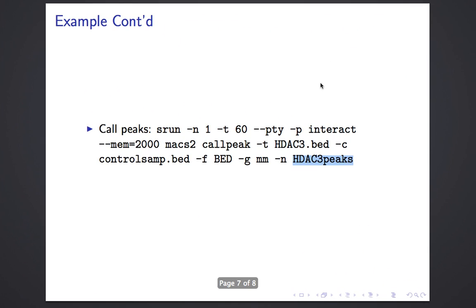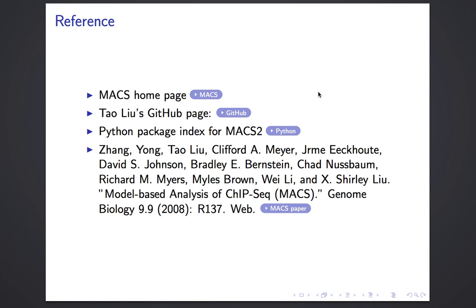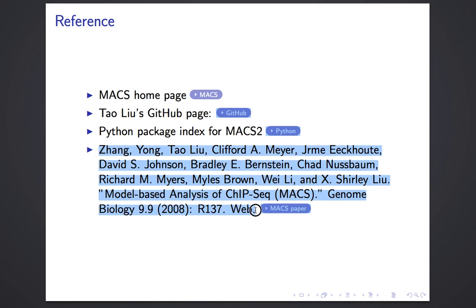That's a brief example of using MACS to conduct ChIP-seq data analysis. To learn more, you can go to the MACS homepage, Taoliuu's GitHub page shown earlier, or the Python Package Index for MACS2. There is also a paper describing the MACS package, which is very useful reading if you plan to use MACS for further ChIP-seq analysis.